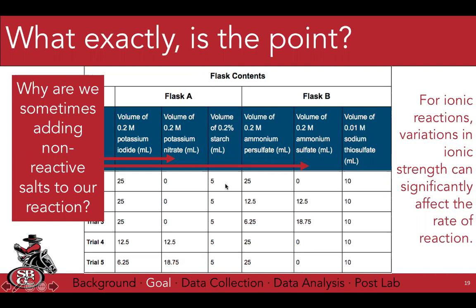So overall volume, concentration, and ionic strength are the same in each reaction flask, even though the amount of the reagent that we care about, in this case persulfate, is allowed to decrease so we can study the rate. Does that make a little bit more sense? Yes, makes a lot more sense. Thank you. Yeah, thanks for asking it.